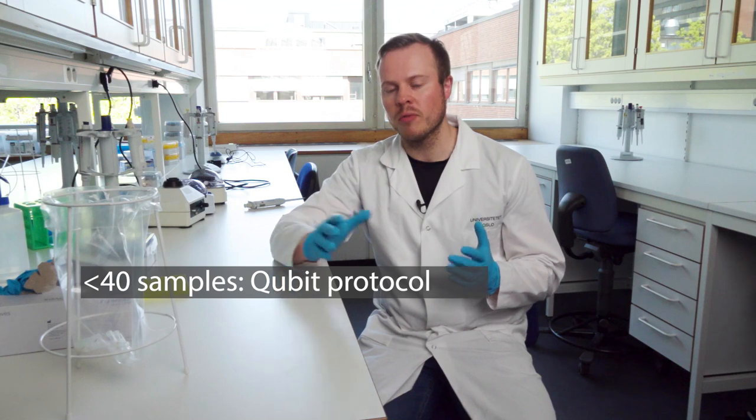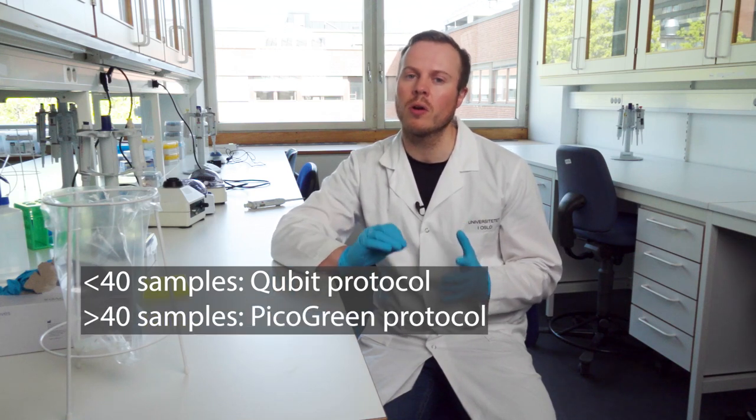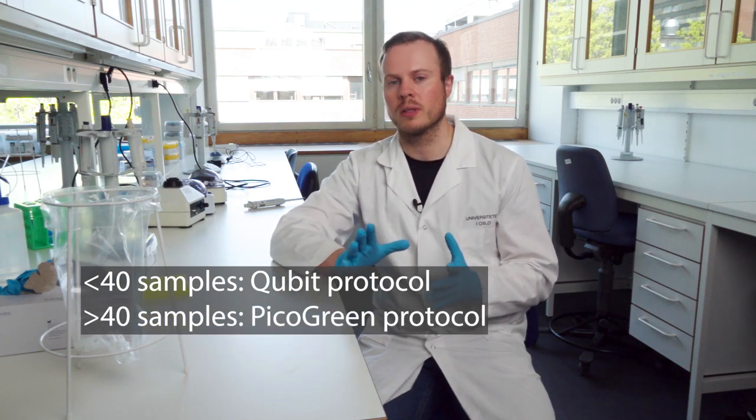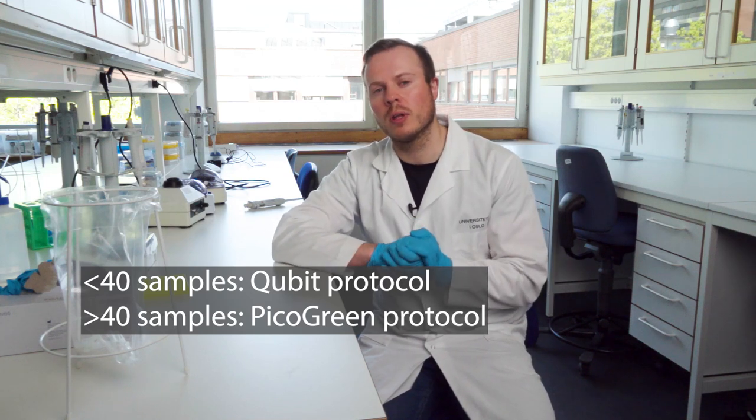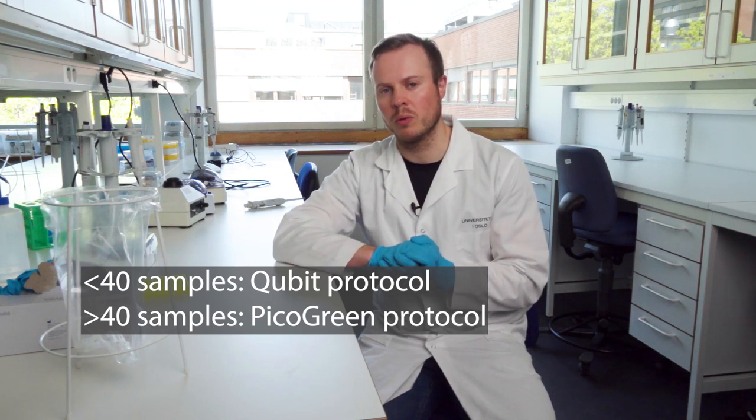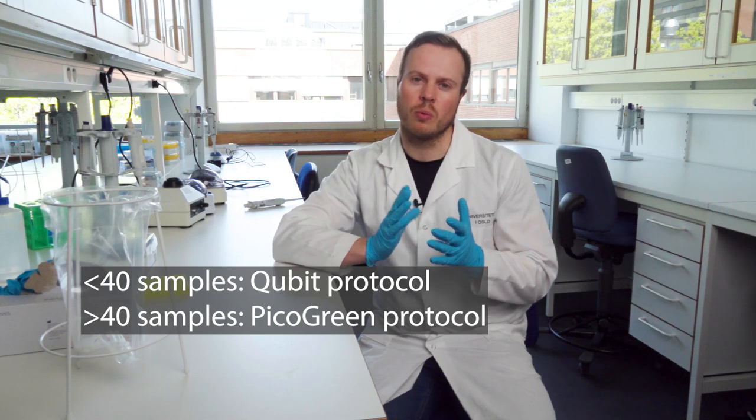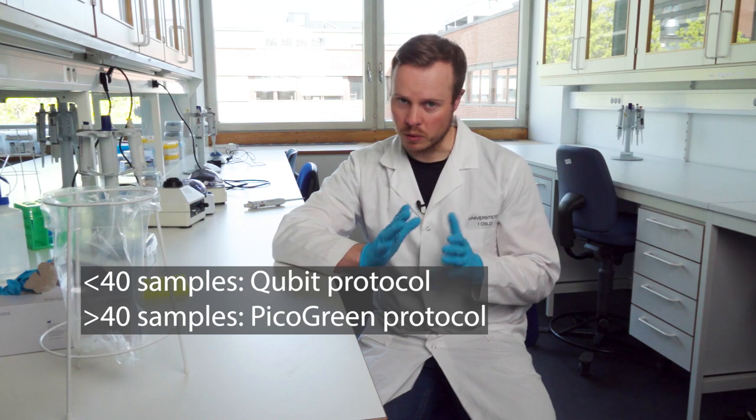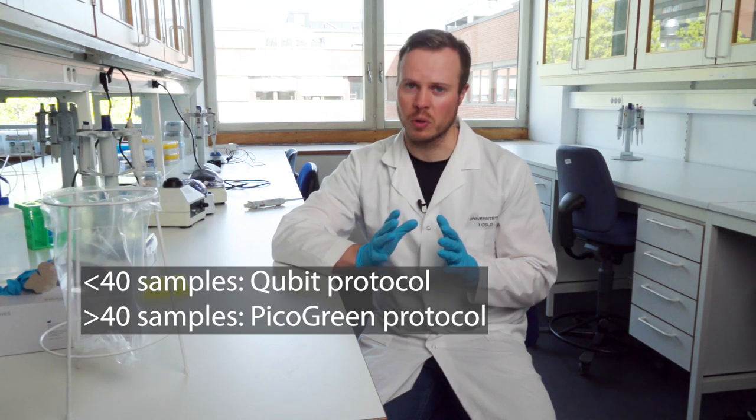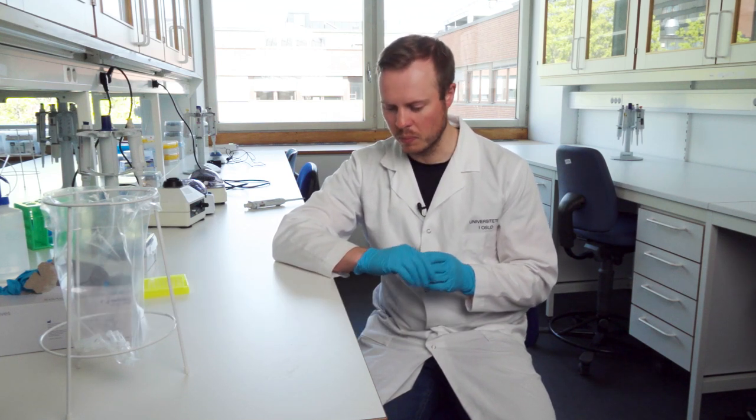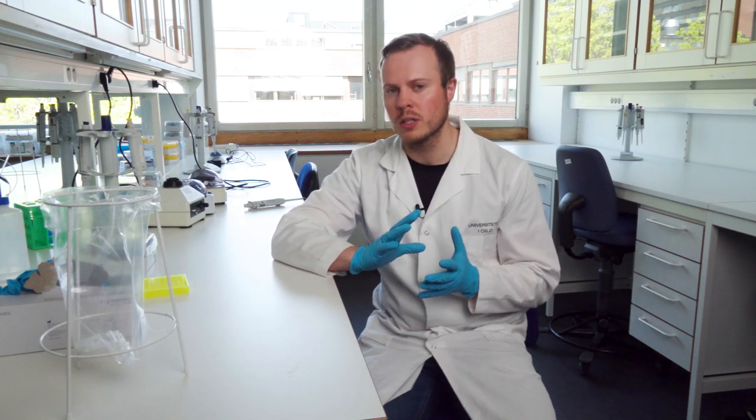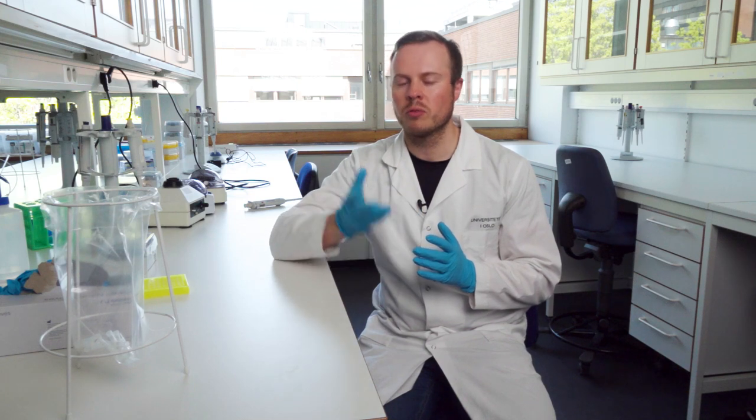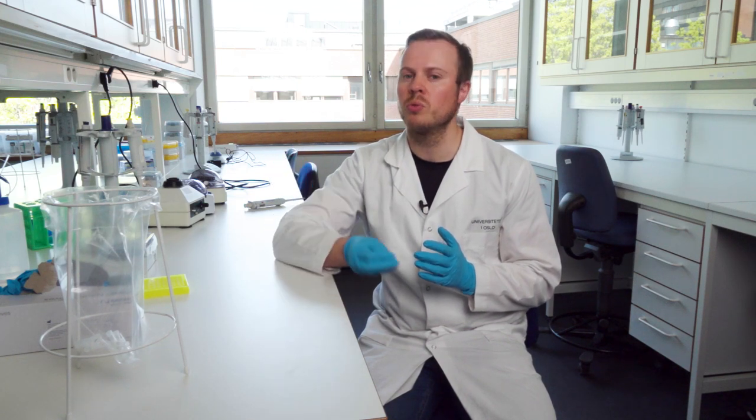If you have more than 40 samples, then I strongly recommend the PicoGreen setup. And here I will explain the PicoGreen more in detail because that's the one that is a little bit more complicated, even though the protocol is quite okay to understand when you look it up in the Dropbox. But how it works is that we use different reagents to bind fluorescence particles to the DNA and then measure the amount of light when it has been irradiated with light in a special machine.